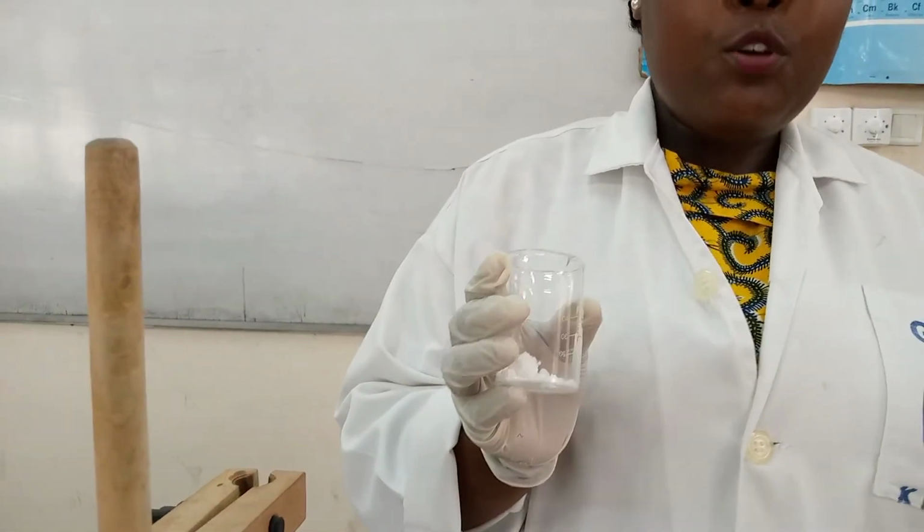126. But what I got is 121 degrees Celsius to 122, which means that this compound is benzoic acid, and it is very, very pure because the difference is just 1 degree Celsius. It's highly pure. So this compound is benzoic acid.